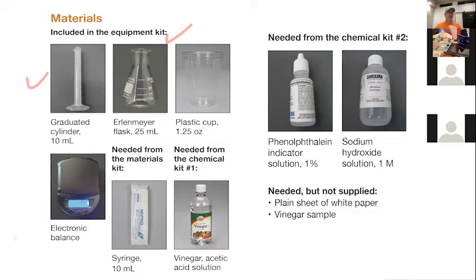I made a mistake last week. I hadn't cleaned it beforehand and had something in it. And instead of turning pink, my solutions turned blue, which was interesting because they weren't supposed to do that. So there was something in there. I think it was copper. I still had some copper in there, and the acid base reaction turned it from green to blue. So that was fun. Some plastic cups, our balance.